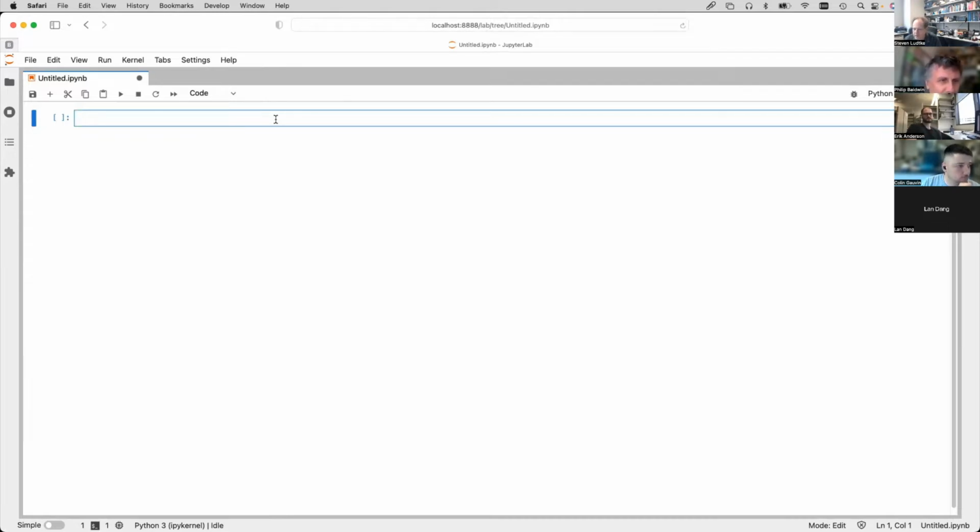All right. Let's go to basic fundamentals and talk about EMData objects and how it's different than a NumPy array, and how to properly do I/O and that kind of thing. So you're probably all aware at this point that EMData is the basic class for images in EMAN2, and this dates back to the late 90s or something like that. This class derived from a class that was written in the very early versions of EMAN1. So this class has been around for a long time.